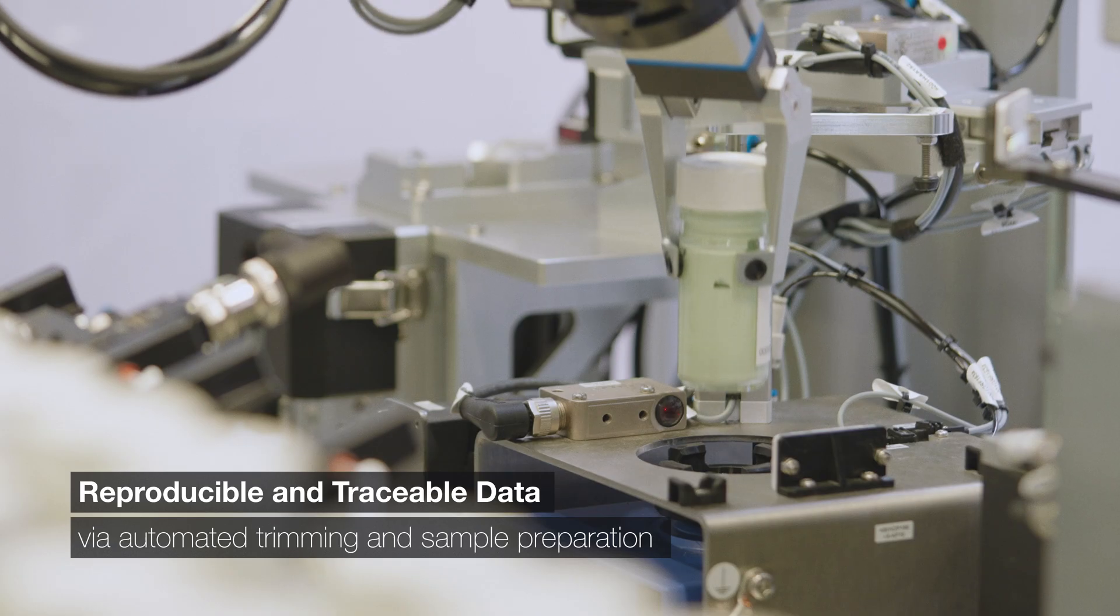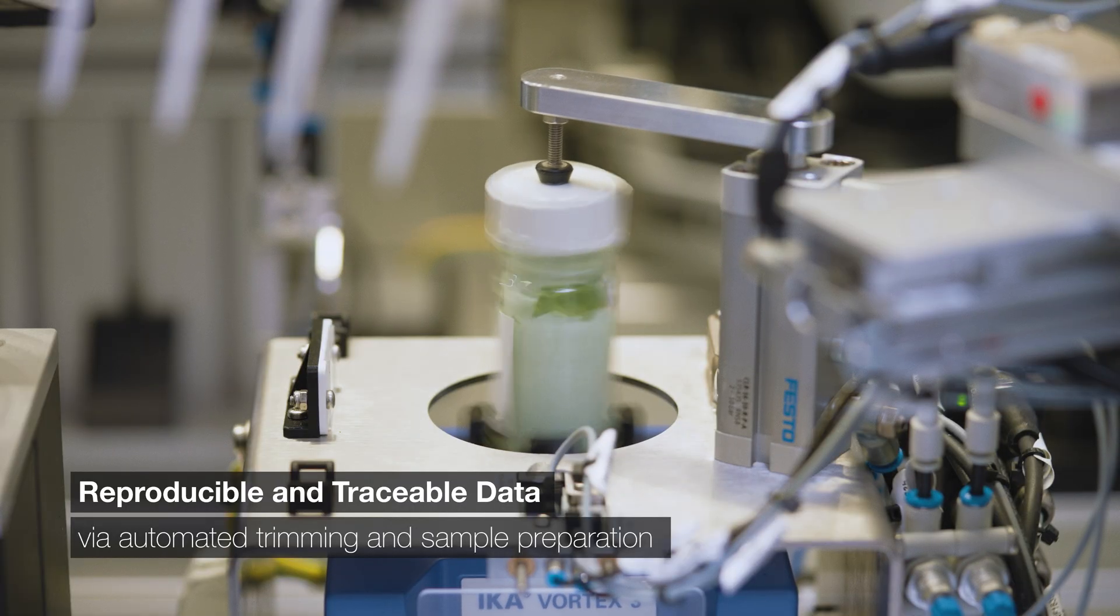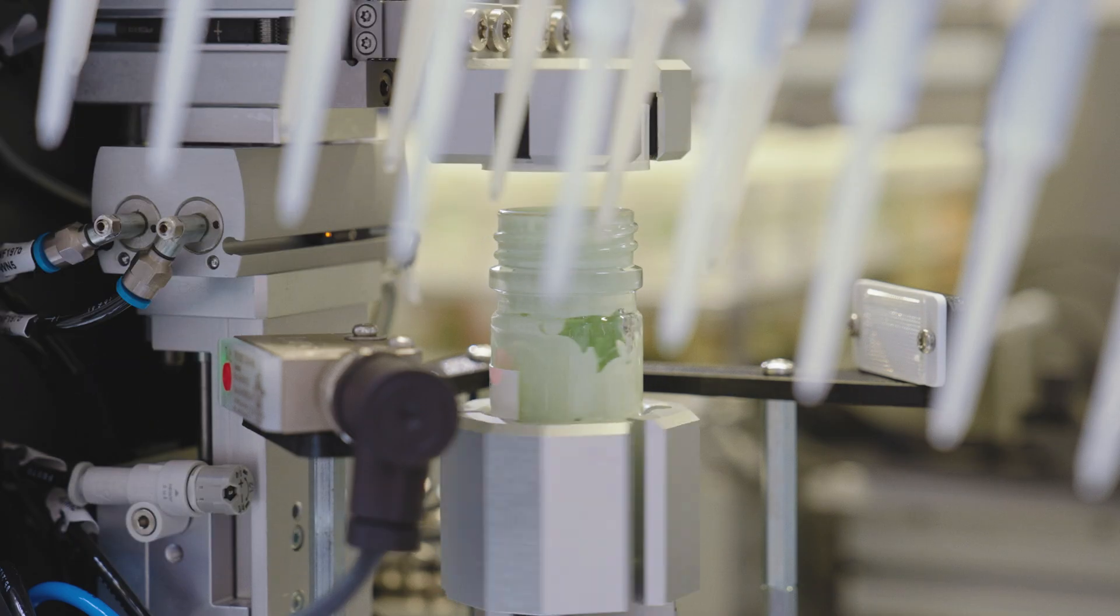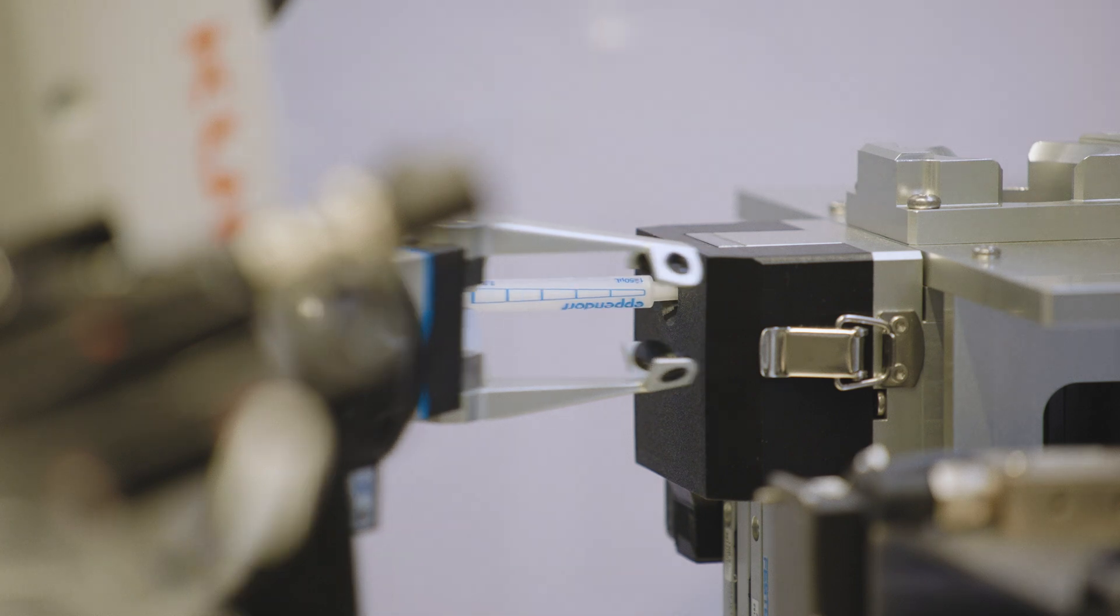Rely on data reproducibility and full traceability with sample management, automated sample preparation, trimming and data transfer.